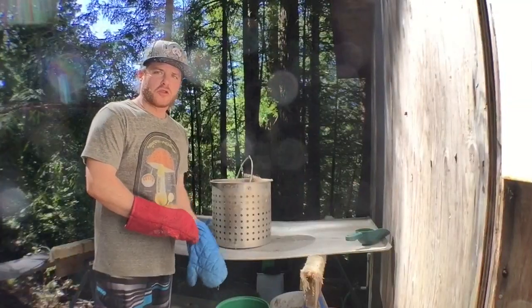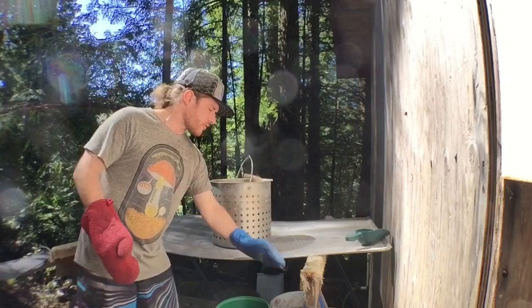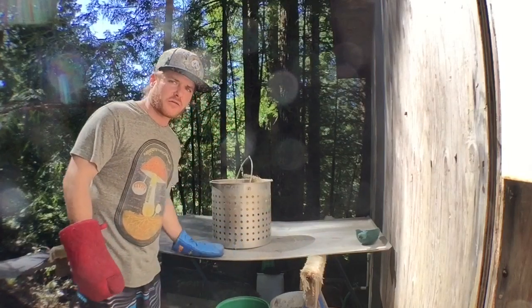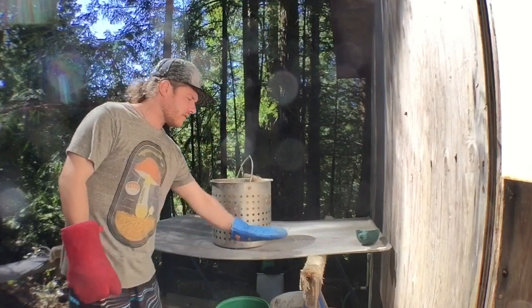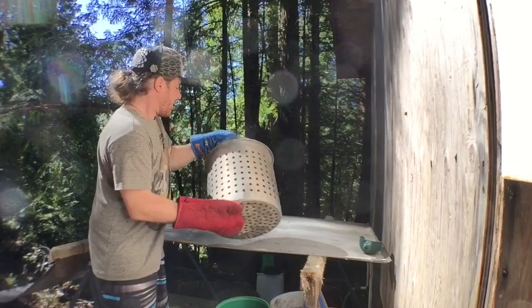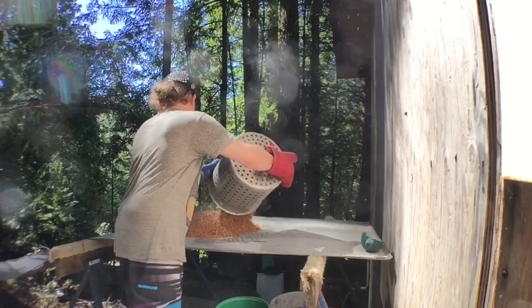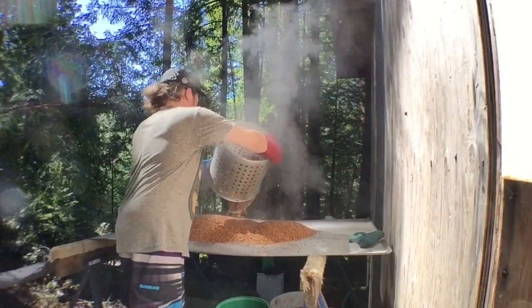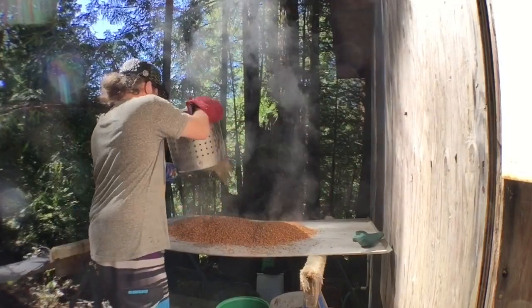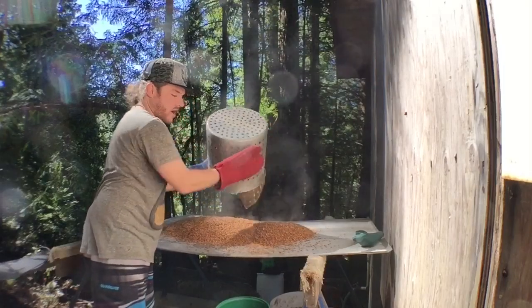Okay, so our normal drying tray is being used right now for something else. So we've got another screen here. This is just a stainless steel mesh screen. And right now we don't have our full setup. So what we do is we just dump out the grains. Now be careful, because they're really hot. You see how much steam is coming off of them? That's what we want. We want as much steam as possible to come off.